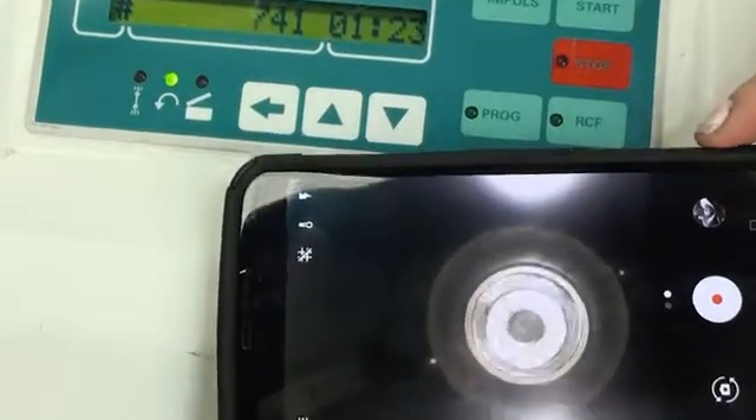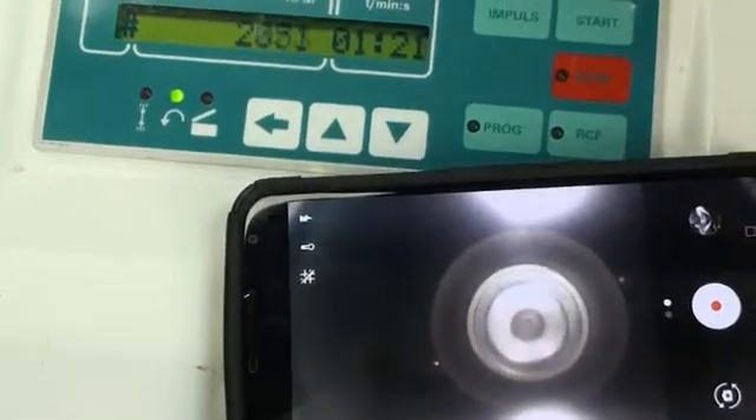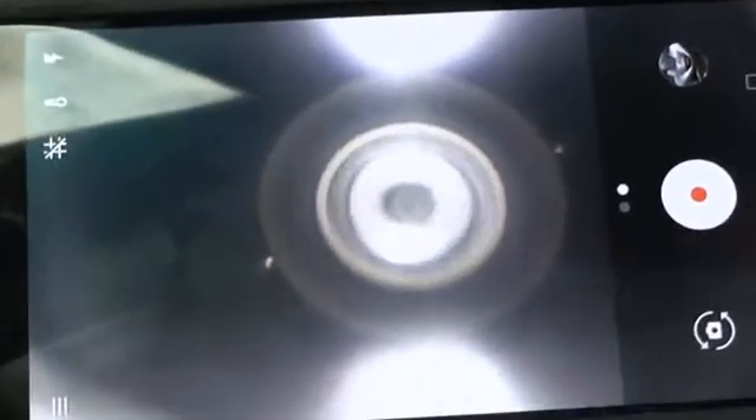And as you can see, it's warming up. It's at 2750 already. We're going to watch as it slows down, so I'm going to keep the camera rolling — I've got a good shot for you guys. And it's counting down, so it'll be about a minute before it stops.